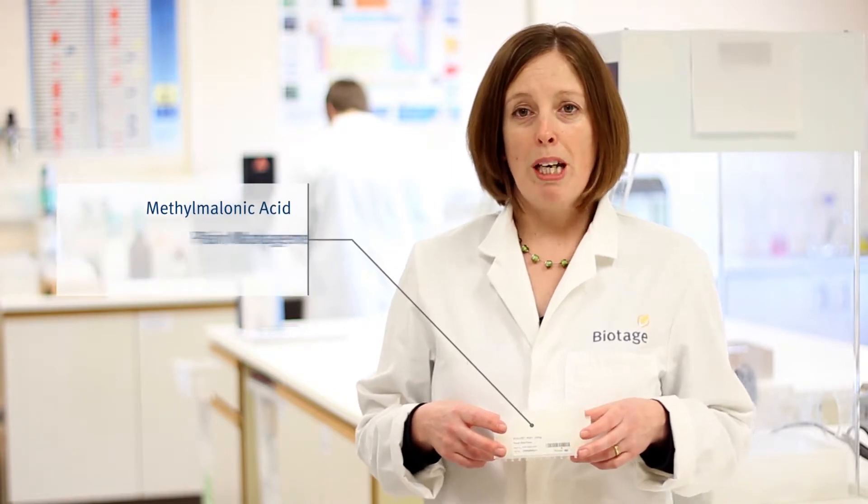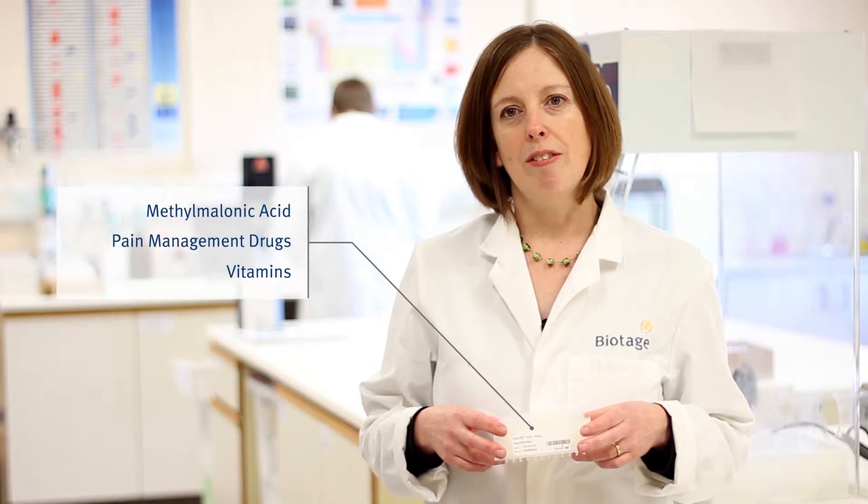Isolute PLD Plus plates are good for a wide range of acid, neutral, and basic analytes — from small polars such as methylmalonic acid, pain management drugs, and vitamins such as vitamin D. The simple process can be done using vacuum or positive pressure, and it's easy to automate for high-throughput assays.